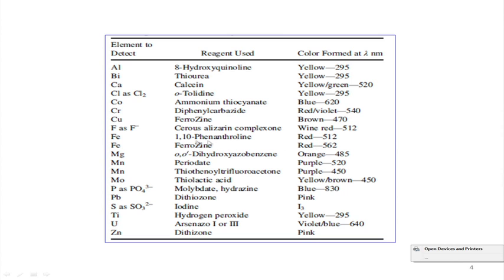So, reagents are different. Earlier we were using thiocyanate to get a particular type of complex with a stoichiometry of 1:1, and the corresponding intensity is very high, and it is not a simple color change for a transition based on the iron as the Fe site, because all these things are written as the metal center, the element to detect, but not in this particular form.